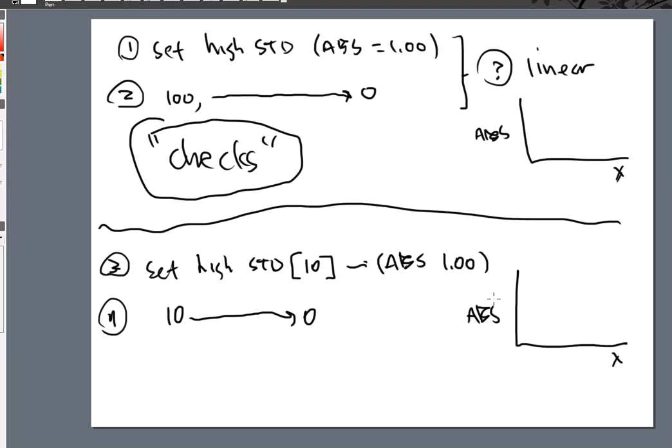That's the whole point in doing this exercise, looking at emission and then looking at how our numbers are affected depending on what we do with it. Just as before, once we set that and once we run all of our standards, then we will have a series of checks that we will have to run along with those standards.